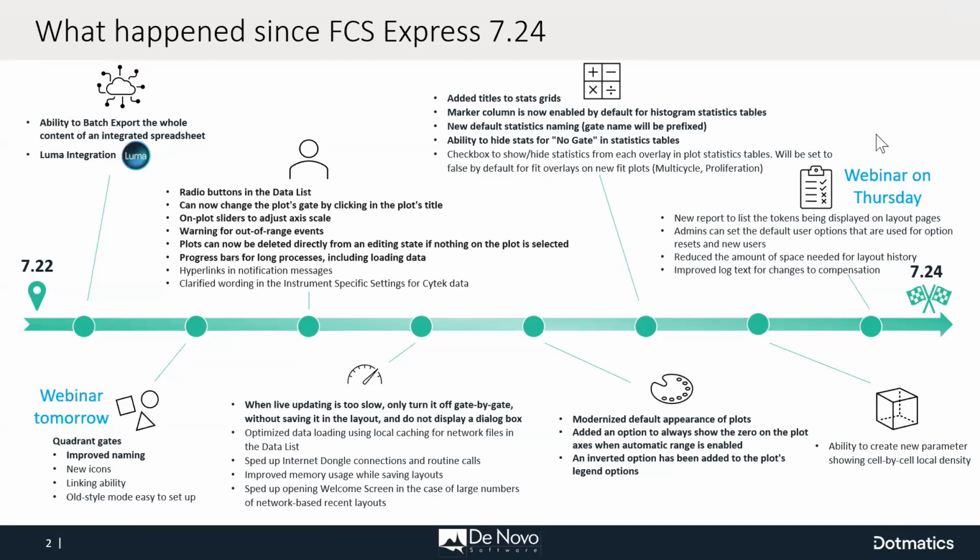I will not go into much detail in these because, as I say, we have a webinar, and in this case, it will be Thursday. So if you're interested in that part, and maybe you cannot attend that webinar, no worry, just register to the webinar so that you will receive the link to the recording. Then, a lot of new features and announcements on quadrants. The webinar will be tomorrow.